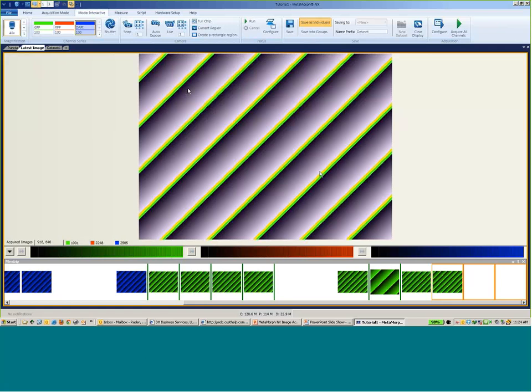Okay, so that is all I have available for the acquisition. In 2 weeks, when we do the image analysis, I'm going to have some sample data images for you to use, as well as some exercises to do like take-home homework. But this week, I don't have any exercises for you. The only thing I can recommend is making sure you have installed MetaMorph, so you can run through last week's presentation to do the install onto your laptops.